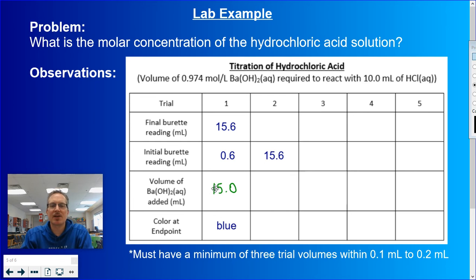So what I'm going to do is quickly run, let's say, 12 milliliters, and then release only one drop at a time of titrant into my sample solution, so that when that one drop does change the color from yellow to green, I will stop the reaction instead of letting it get all the way to blue.